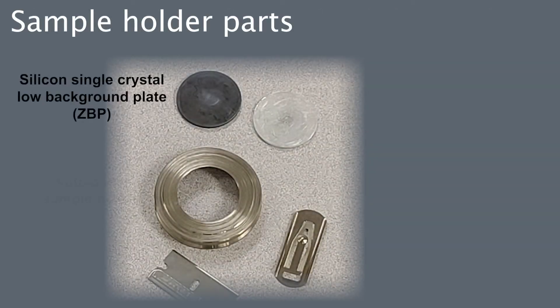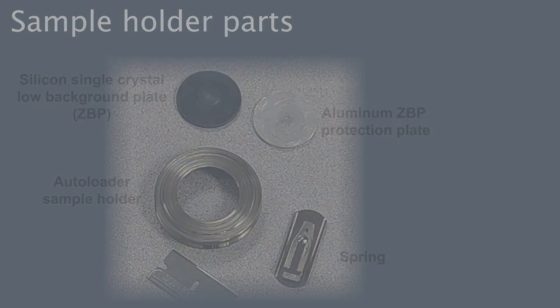The sample holder parts include silicon single crystal low background plate, auto-loader sample holder, spring, and aluminum protection plate.